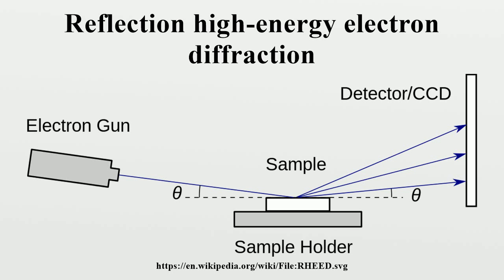Many of the reciprocal lattice rods meet the diffraction condition. However, the RHEED system is designed such that only the low orders of diffraction are incident on the detector. The RHEED pattern at the detector is a projection only of the k vectors that are within the angular range that contains the detector. The size and position of the detector determine which of the diffracted electrons are within the angular range that reaches the detector.